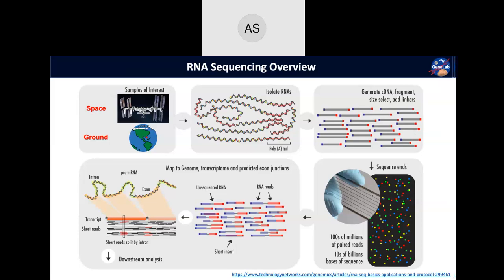And then of course with the primers that we add on, we'll then be able to have a polymerase sequence it. And so after we add this stuff on, we introduce it into the flow cell, and then we allow the sequencing to take place. And as I mentioned previously, this is an example of Illumina sequencing, and so we see those different colors of yellow, green, red, and blue representing our A, T, C, and Gs. And so we know based on what color, what base was incorporated at that position in the DNA that we're trying to sequence.